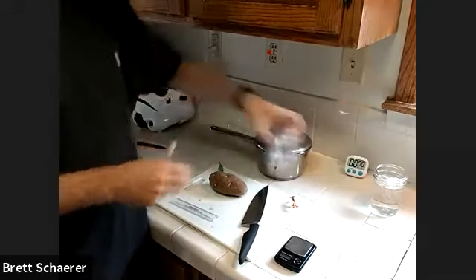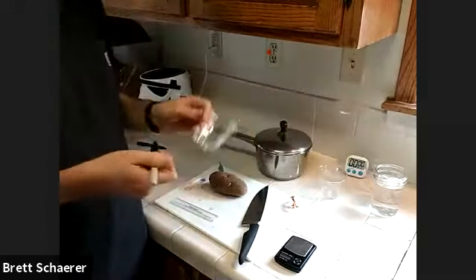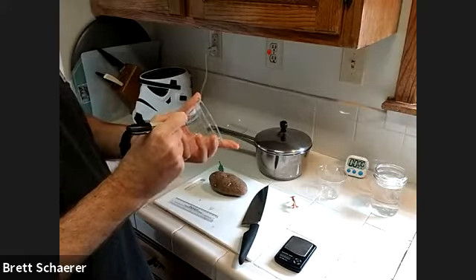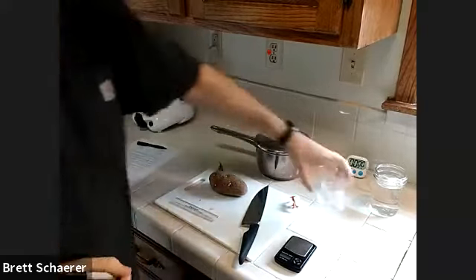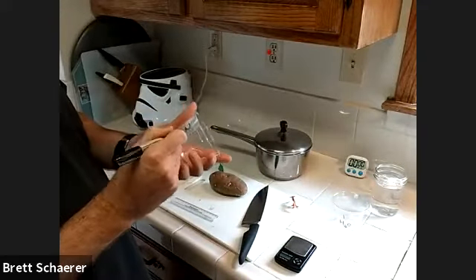All right, so now it is time to cut our potato slices. And actually, before I do that, I'm going to get a couple of cups and I'm going to label them. I'm going to label cup number 1 as being just plain tap water. And cup number 2 as being the salt water.